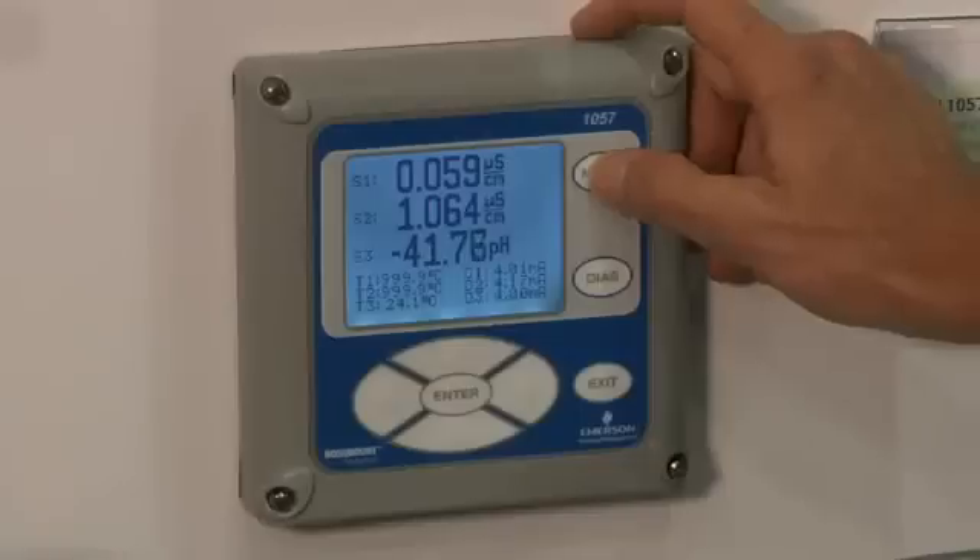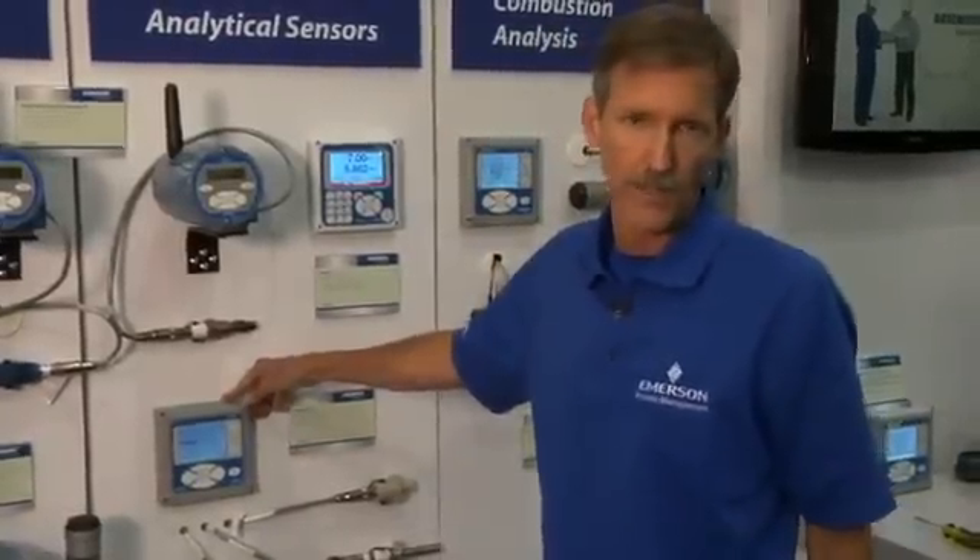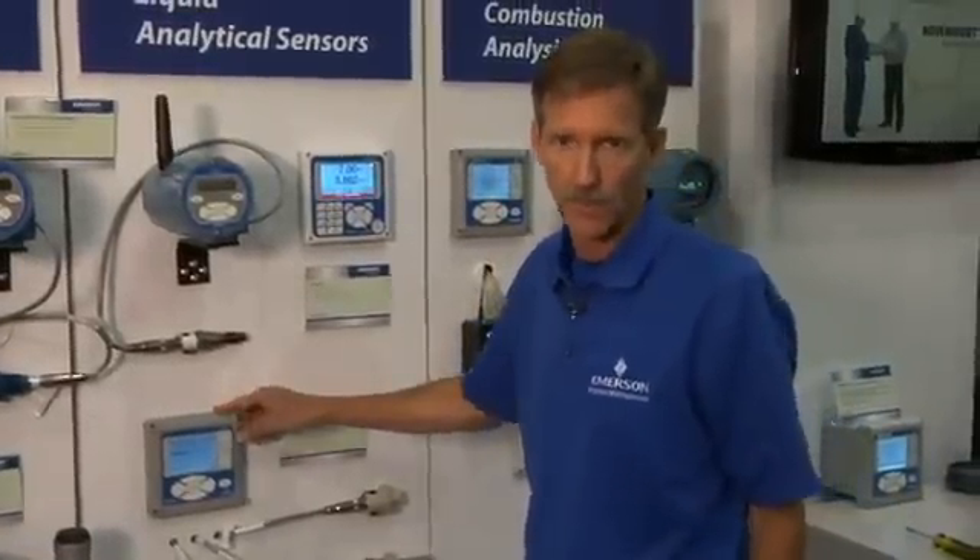The second feature I'd like to talk to you about is the ease of navigation using the Model 1057. Using the front overlay of the 1057, you can push the menu button to easily calibrate or program the unit, and even users that are unfamiliar with user interfaces find this quite easy to use the first time.